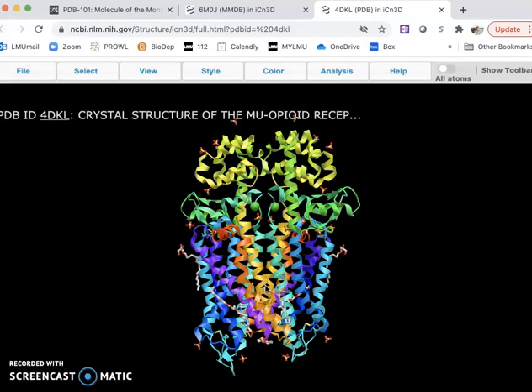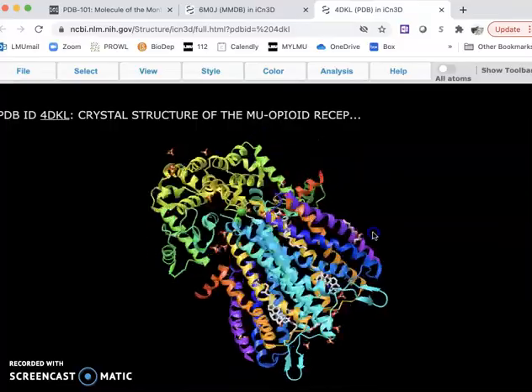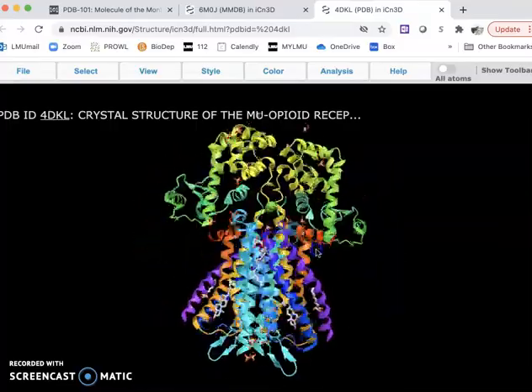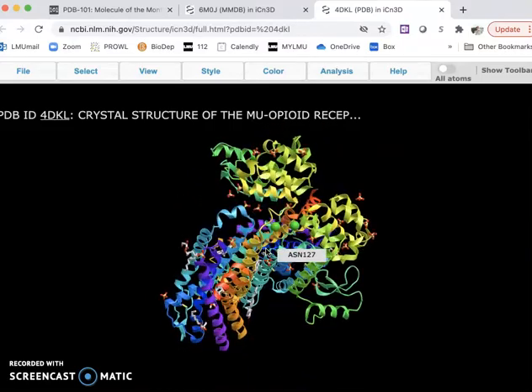You could see based on those colors that my opioid receptor is made from two identical proteins bound together. And this is my protein I wanted to share with you today. Hope it helps.